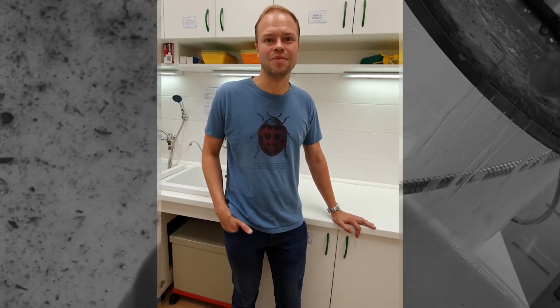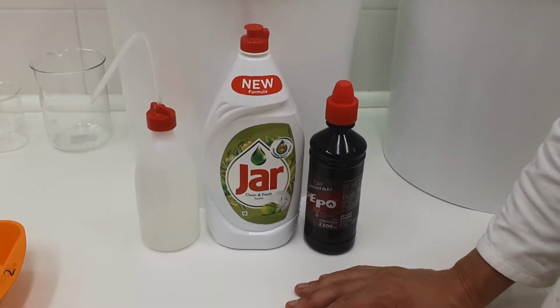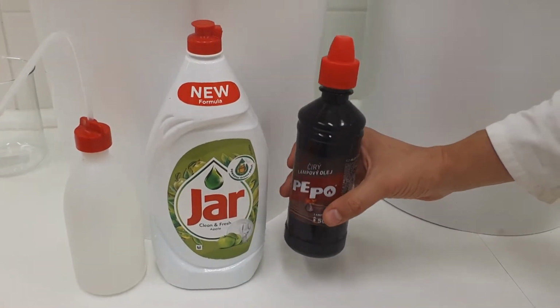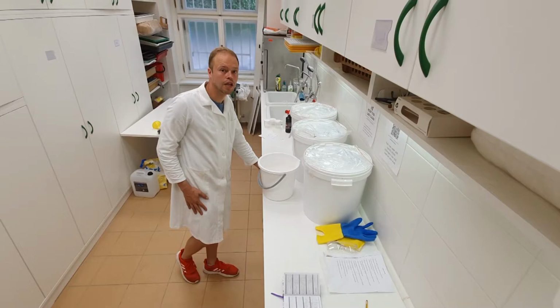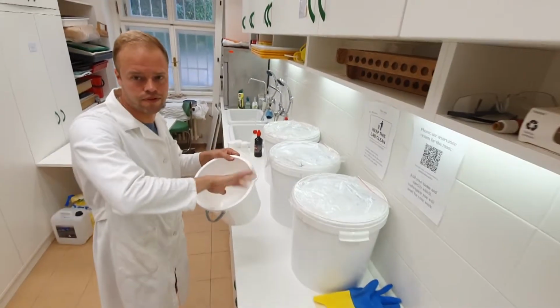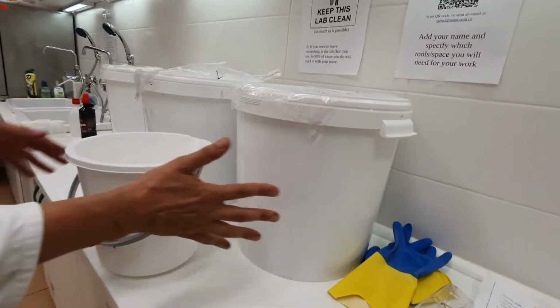So let's get started. The chemicals used in this lab method are very simple. First of all, you get paraffin oil, ethanol and soap. You also need some buckets, preferably white ones, so you can see everything that is floating around in there. These buckets are a bit large and these are a bit small.